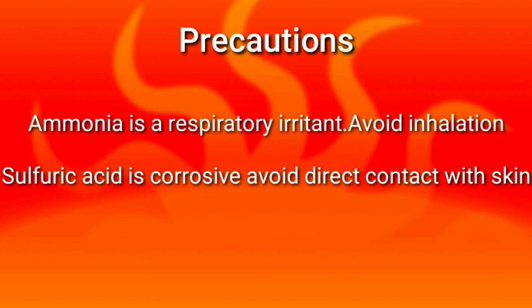Precautions. Ammonia is a respiratory irritant. Avoid direct inhalation. Sulfuric acid is corrosive. Avoid contact with skin.